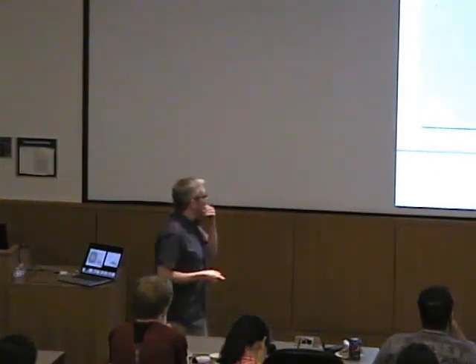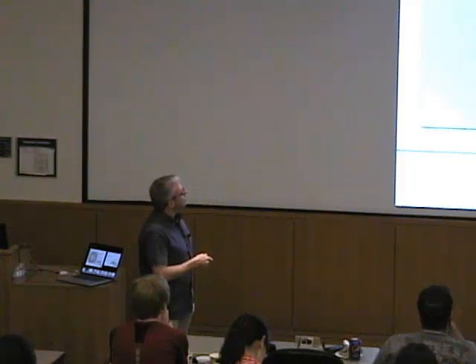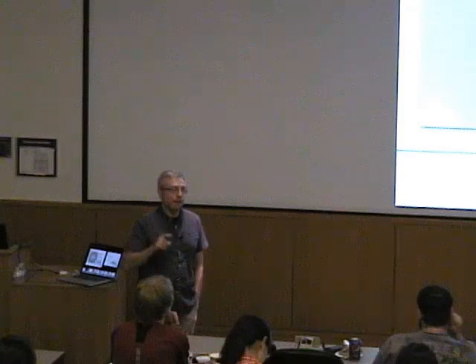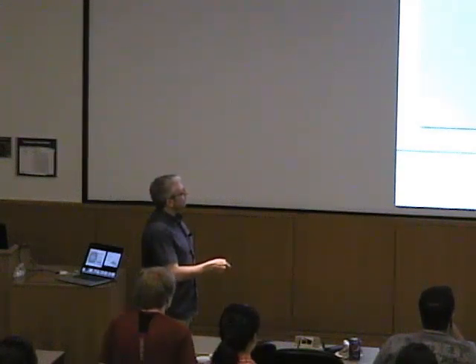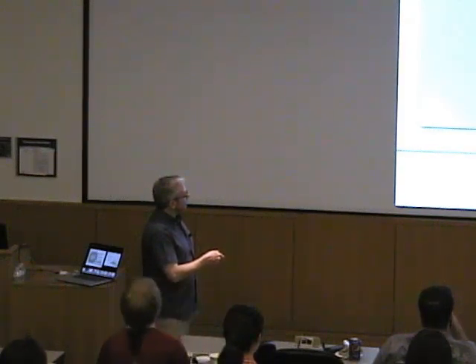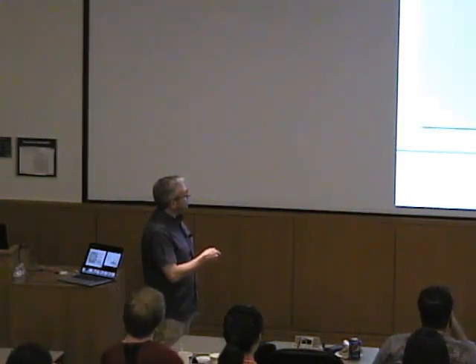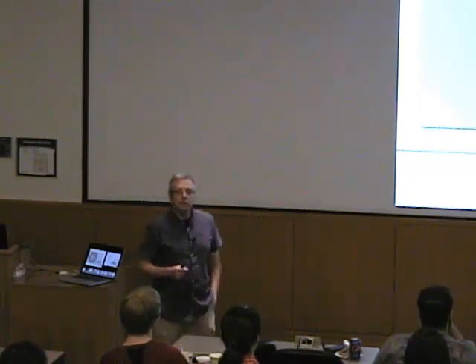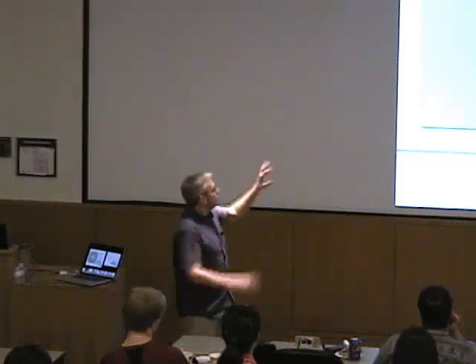This can be 50 or 60 or 180 as in the practicals, or 10,000 as on the free electron laser, but it's always the same. And all the data we draw out of that is for each black spot, for each single black spot, we get an intensity value, and we need to put indices on this black spot. And they are integer indices. They're called the Miller indices. We call them H, K, and L. And they are just like the position in this whole diffraction lattice that we have here.